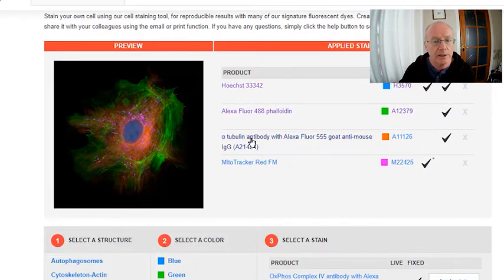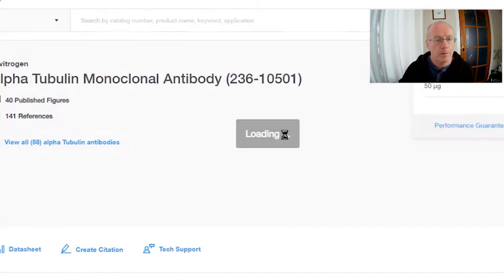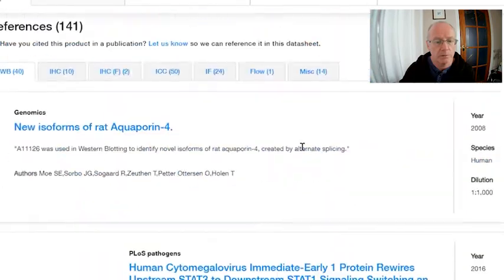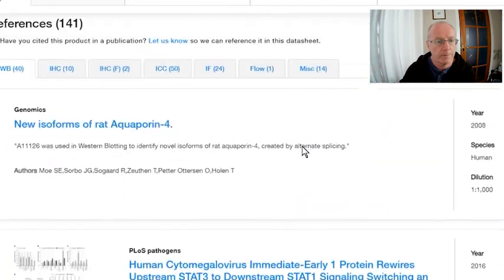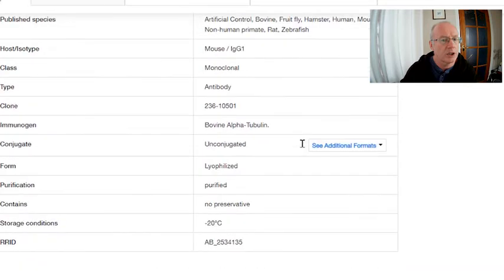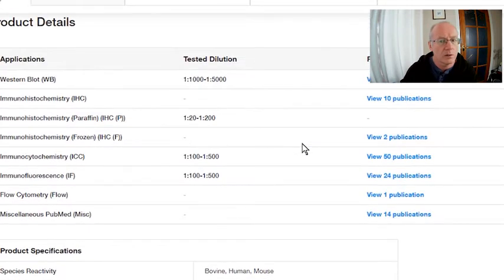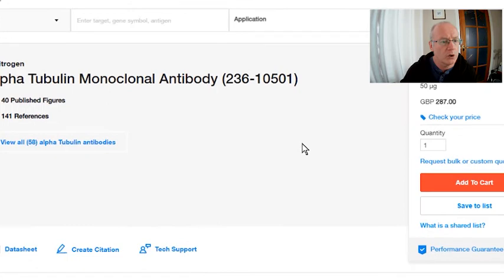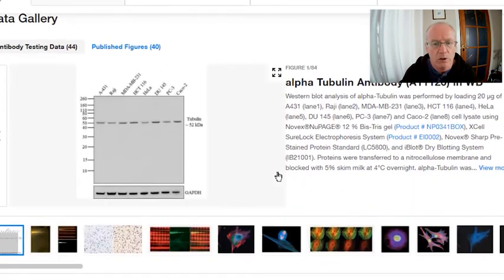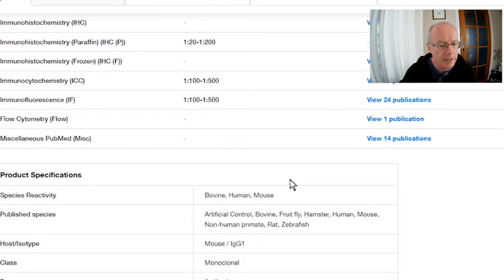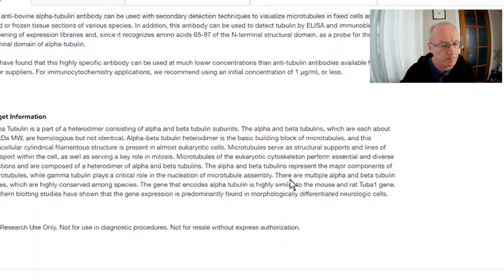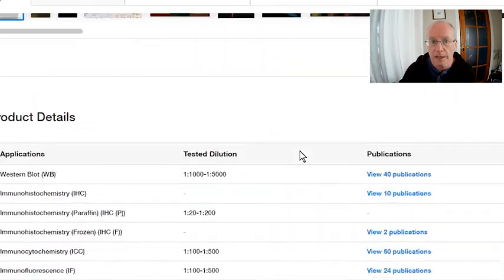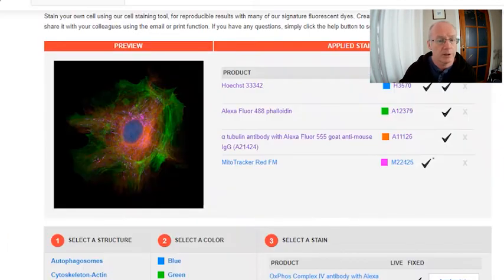Let's look at the tubulin Alexa Fluor 555. Let's look at its excitation and emission spectra, hopefully down here. So we don't have an excitation and emission spectra for this one that I can see. So what you would need to do in that case is that you would have to search through the literature or read in some detail the information that's on the website in order to determine what is the excitation peak and what is the emission maxima. So bear in mind that not all of these dyes will have a spectra.